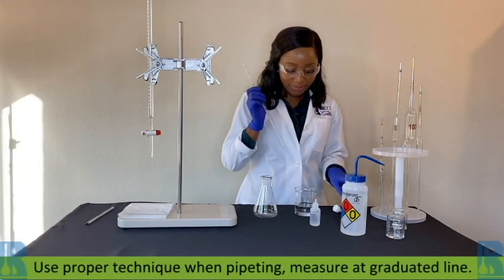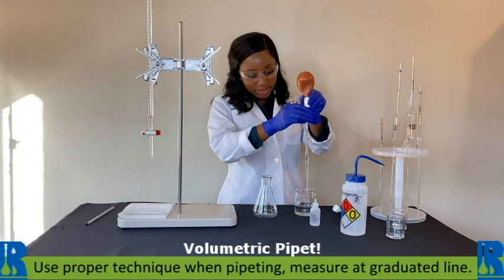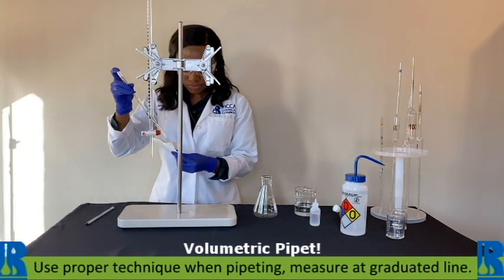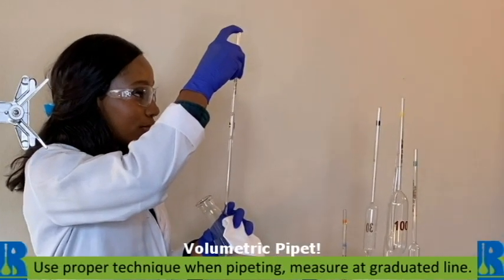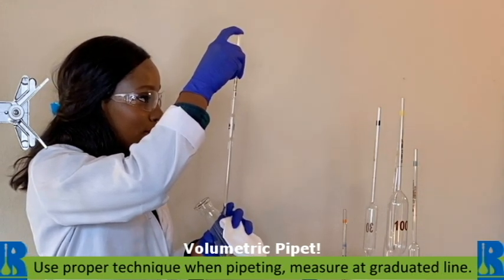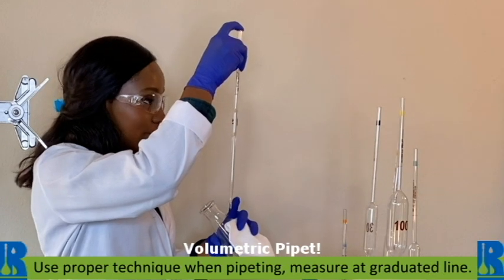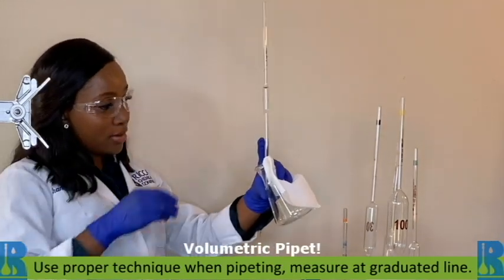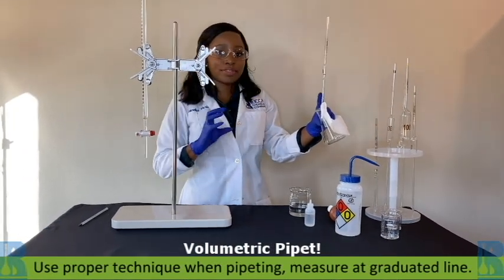Let's pipette our sample now using a volumetric pipette. One of the things that's most important when pipetting is to make sure that the meniscus, just like on the burette, is at that graduated line. Hold the pipette perpendicular in the flask, and that way we're going to make sure we dispense everything.